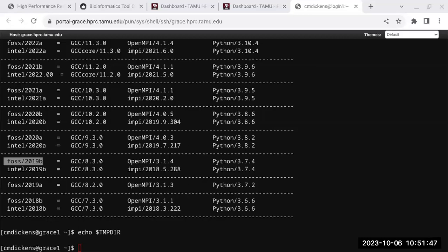You can either run the GUI or run it on the command line if you have 10 files or so and don't want to wait for it. You can just run in the command line and then come back later and check the output files. FastQC uses just 1 core per file. So if you have 1 file, you don't need to reserve the entire compute node to process 1 file. Most of the time, it's pretty quick. If you're going to do 1 file, you can do it on the login node. But if you have 20 files or more, just do it on the compute node and use 1 core per file.